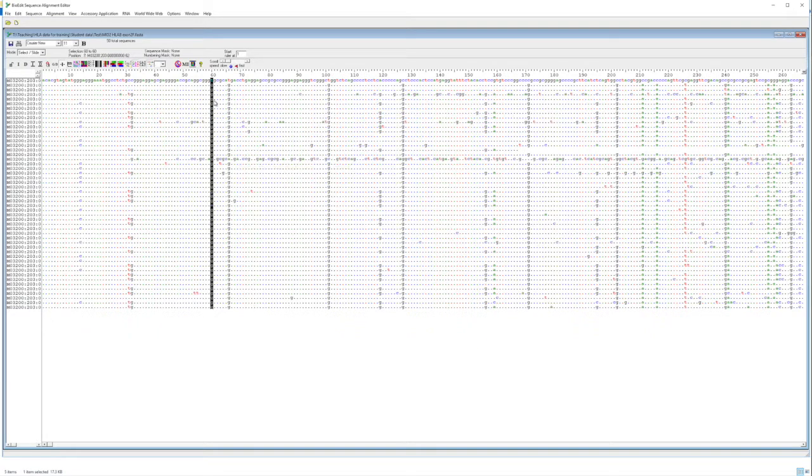If I examine position 60 in detail, I can see out of the 50 sequences we had, the master sequence has reported a T at this position. An A has been recorded here, and then we have 48 reads which recorded a G. What I would think has happened here is that we have 2 sequencing substitution errors, the T and the A, and in actual fact it should have been a G in this position.